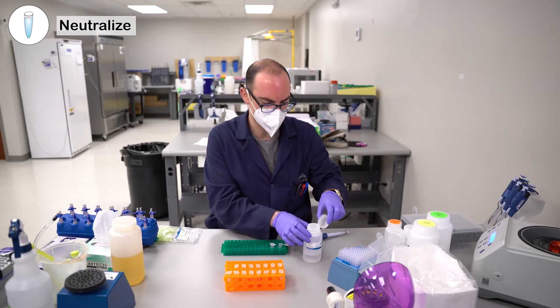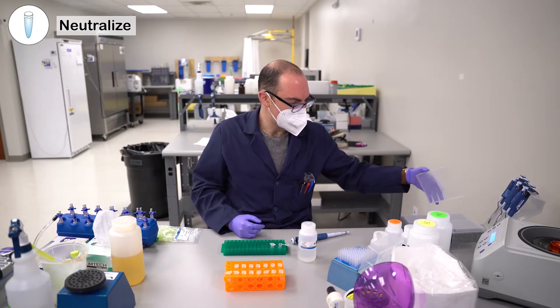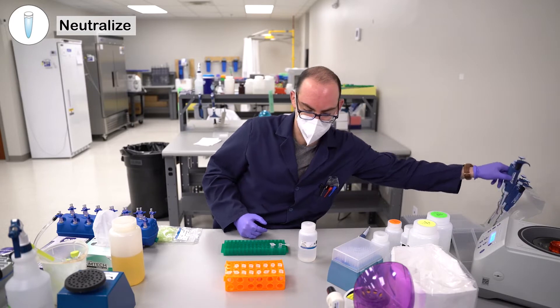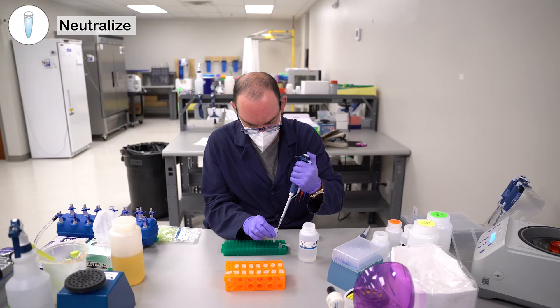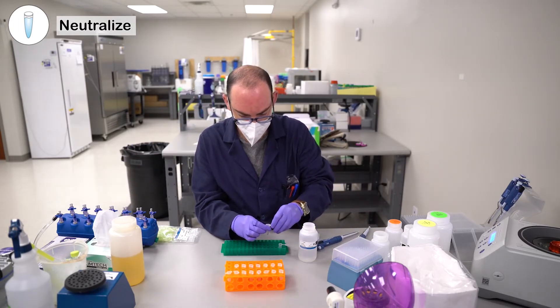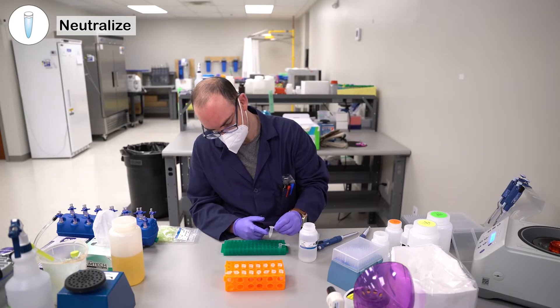Let that sit for three minutes. You're then going to add 85 microliters of the N3 buffer. Again, you're not going to pipette mix this — you're going to invert it 10 times. You should see some white particulates starting to form, some flocculant.